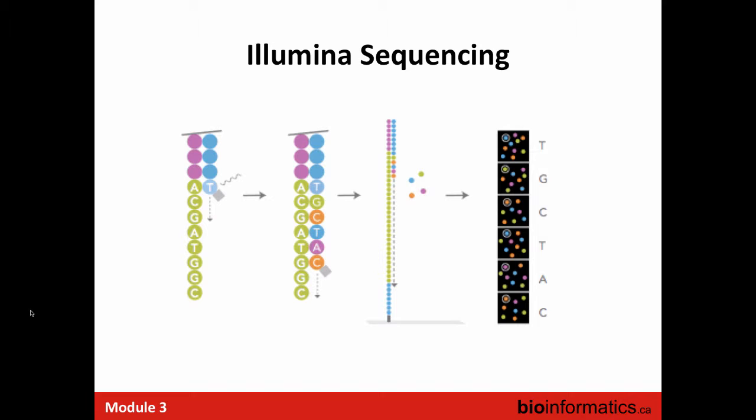Now, on the flow cell that these DNA molecules are attached to, you perform amplification to amplify a single molecule into this cluster of thousands or tens of thousands of molecules. And this gives you this circular area on there. All of those molecules should have the same color at the same time. And literally, in sequencing, the DNA is just reading off the patterns of colors. So if you see blue followed by green, that means it's TG and so on. You're just reading the color.